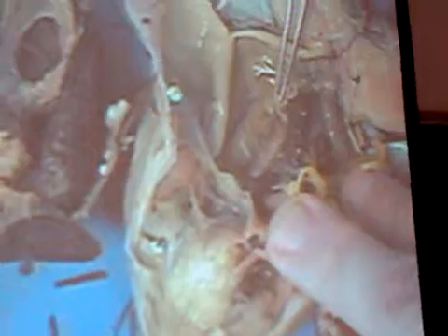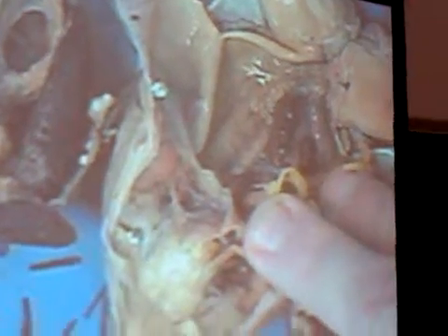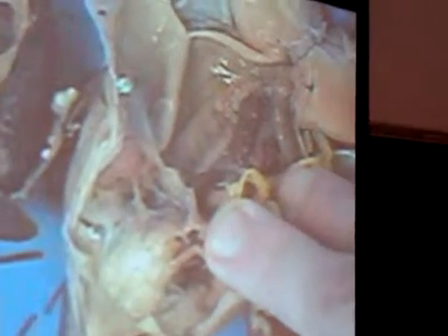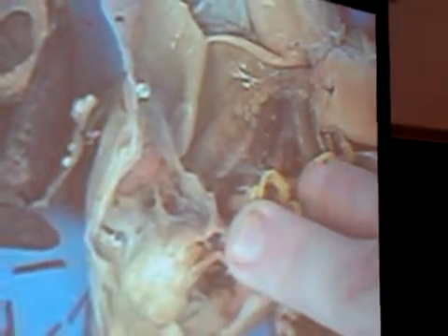You're going to say, what's this then? These things have got what are called vestigial oviducts. Don't know why a male leopard frog has got vestigial oviducts, but they do. And if you look at your diagram, it talks about the male with these vestigial oviducts, which means they're functionless. Don't know why, and it's only these leopard frogs, I think, that have vestigial oviducts.